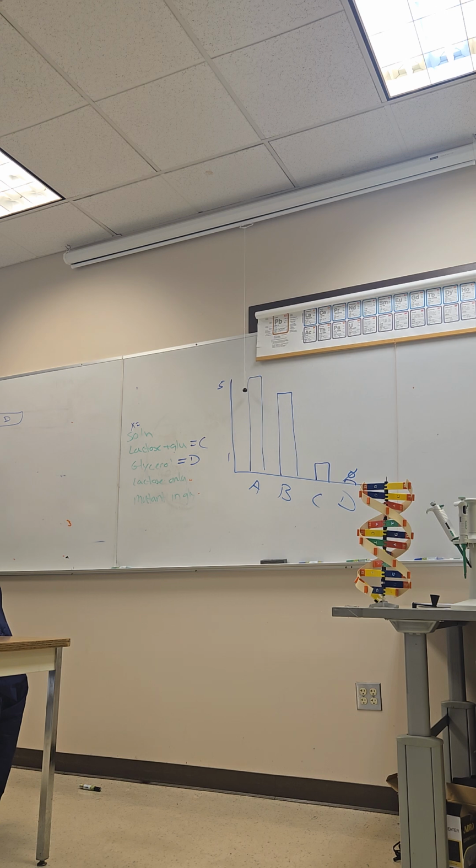I'm lost on how the yellow color tells us this. Because it tells you if the enzyme is working, and how much enzyme there is. What is ONPG? An enzyme? No, not an enzyme. It's an artificial indicator. It's an artificial sugar, just like lactose, but what happens when the glycosidic linkage breaks? It turns yellow. So it tells us the enzyme is there and working, correct? So if it's barely yellow, it tells us how much enzyme is there. A little bit of enzyme, not much.